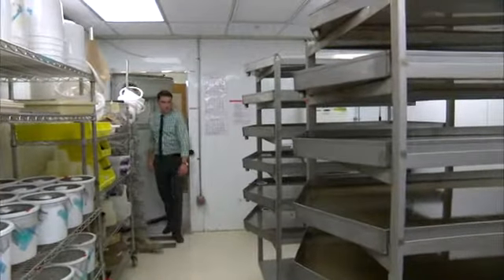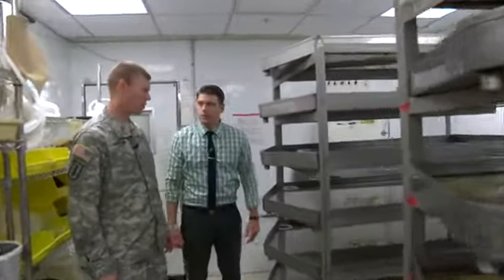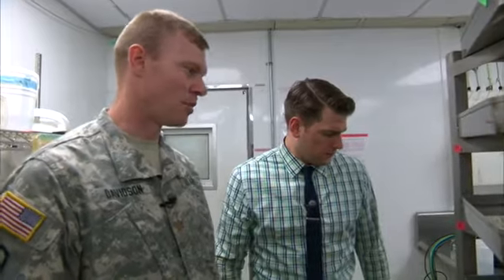So this is the insectary where we raise our mosquitoes. So you'll notice it's a little warm and humid in here. It's about 80 degrees Fahrenheit, 80% humidity. That's because that's how the mosquitoes grow the best in here. Got it. So because mosquitoes are aquatic, we have to rear them in water. So this is how the process starts.